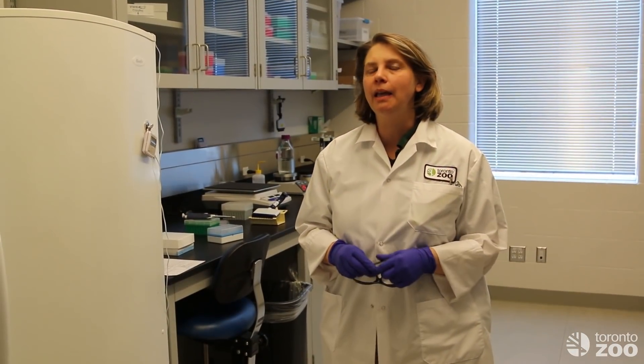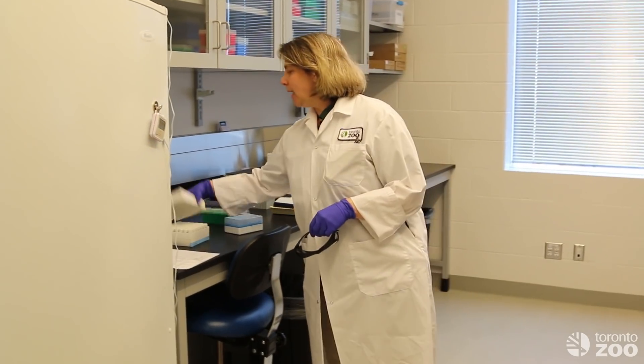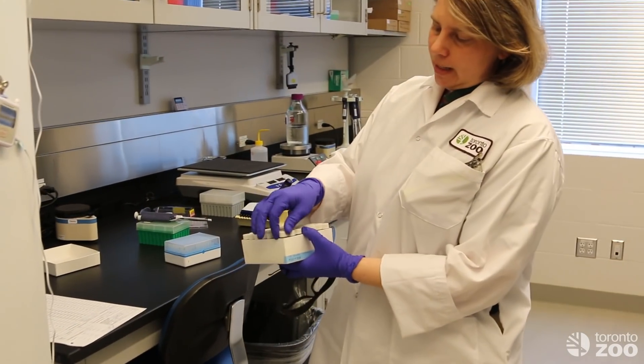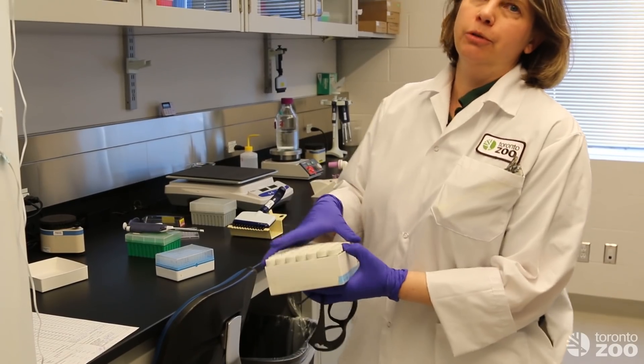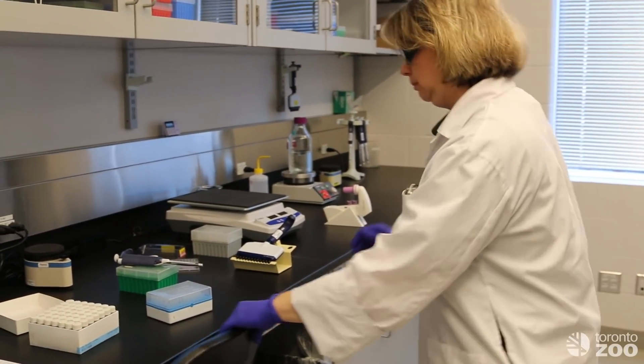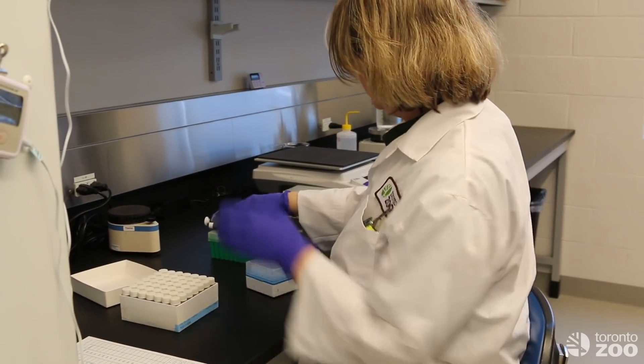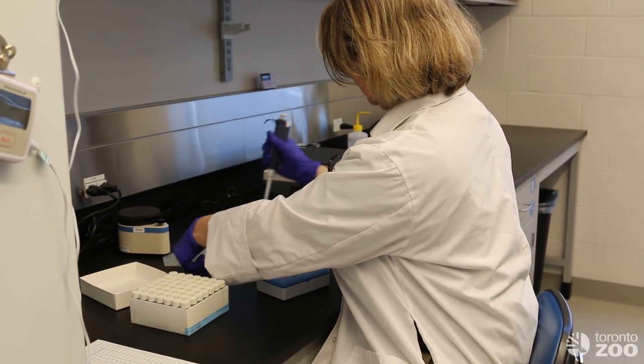We are now in the endocrine assay lab and we are going to take the extracts from Mestari and analyze them for progesterone. First we have to dilute them because there is a lot of progesterone in there.